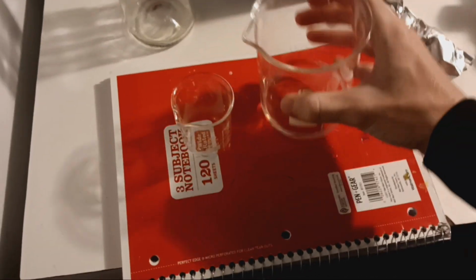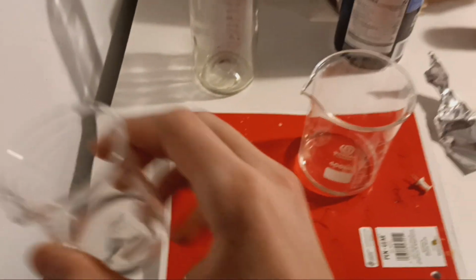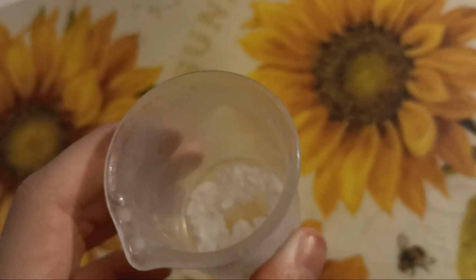This is a method of separation called crystallization, or that's what I believe it is. Basically, we freeze the solution or cool it very much. This decreases any solute's ability to be dissolved into the solution. As temperature decreases, the ability for water to dissolve things should also decrease, so thus, we should have some kind of crystals form.